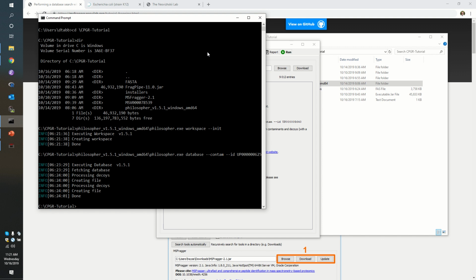So in this case, I actually read the manual, I have to say. I followed the directions on how to download a sequence database designed for use with Philosopher. So on the command line, and this is the part that I know may just cause a lot of people to quiver and shake, and I'm sorry about that. I have used a Philosopher workspace.